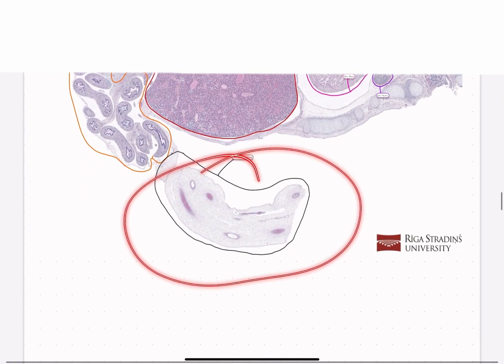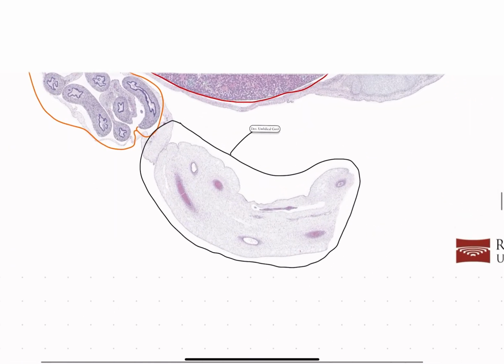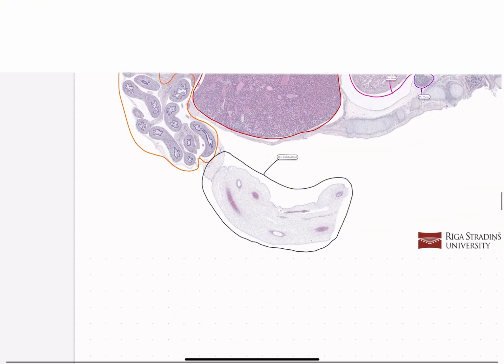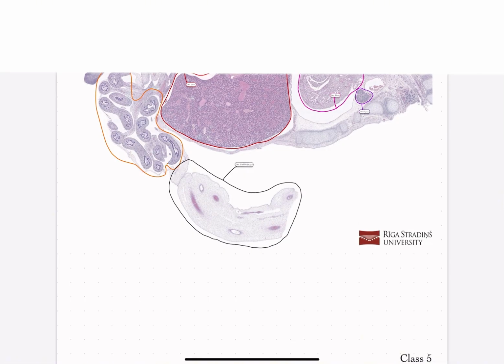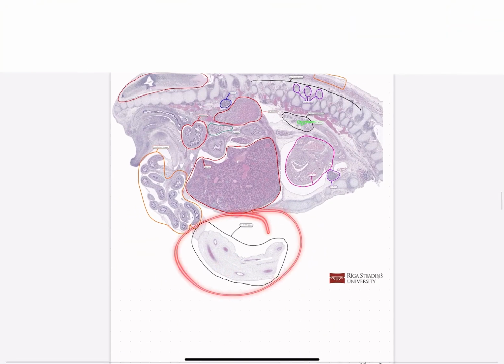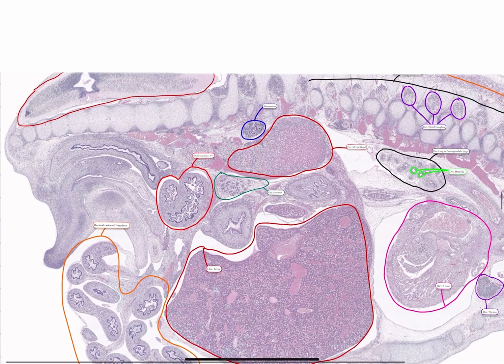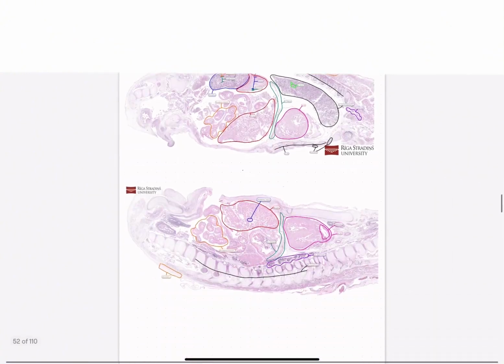Here we can see the developing umbilical cord. Isn't that cool? So we can see the artery here. We can see the vein. I think that would be also an artery. If it was cut in a transverse section, it would look very much like the umbilical cord that we saw in colloquium 1, with the Wharton's jelly and everything. And this might still appear in colloquium 2 from professors who want to just test you from the colloquium 2 knowledge if it's a structure that does appear in their slides, but it's not that important, I would say. I wouldn't have studied on it personally.